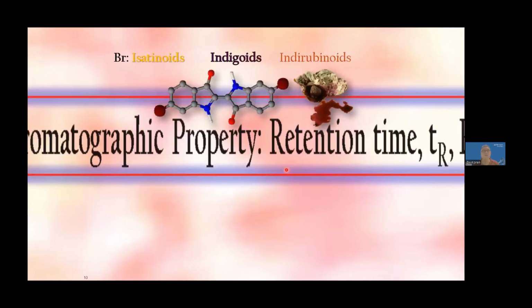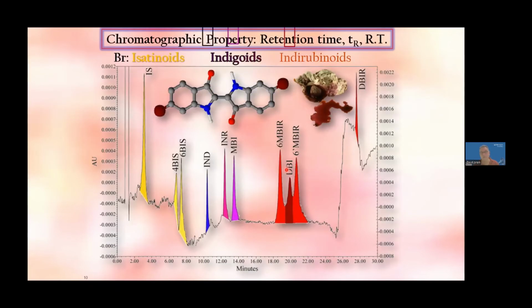And HPLC, there's nothing like the HPLC. HPLC gives you the full gamut of detectable dyes. I say that the HPLC sees the invisible. You can see in this purple pigment, which comes out of this particular snail, the famous Murex trunculus or Hexaplex trunculus, it's a very nice blood red pigment. To the eye, of course, it has a certain coloration, but hiding in this particular pigment is a whole bunch of different colorants, even yellow, and there's, of course, indigo blue, and different types of reds in there also.